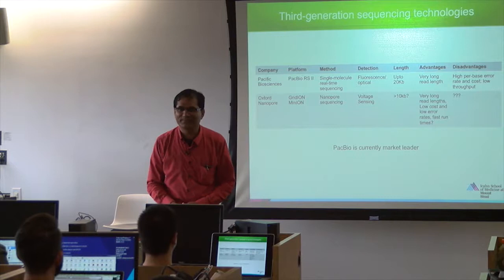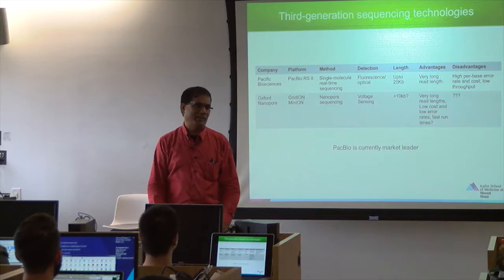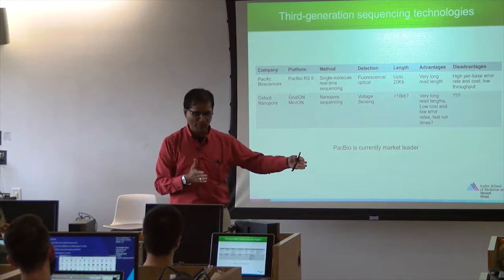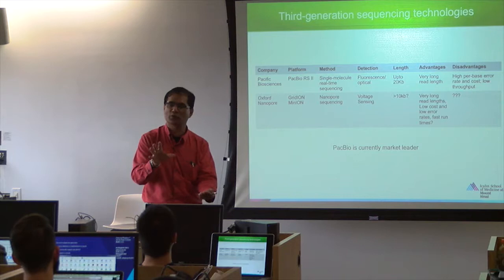Why would the answer not be to develop cameras that have a higher frame per second? You can develop the cameras, yes. You have to go to the camera guys: please, can you develop? They'll say, okay, come tomorrow. Maybe it will take 1 year. What I'm saying is use the available technologies. When they develop the technology, you can also make changes here. But when I am developing something, I will take other available technologies and make best use of them, and modify my technology or the chemistry to suit.